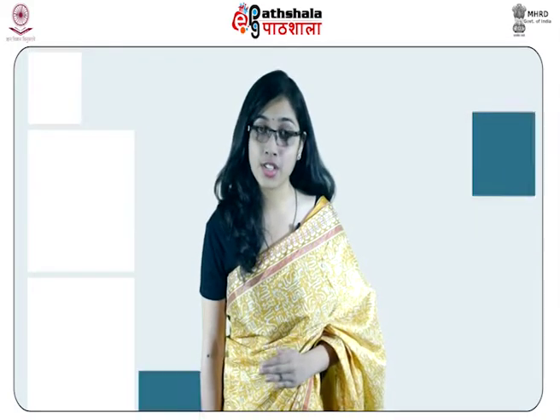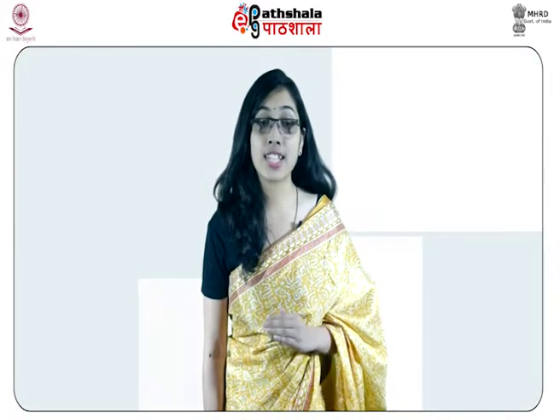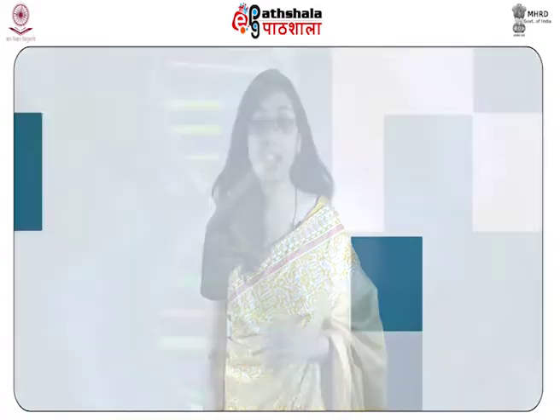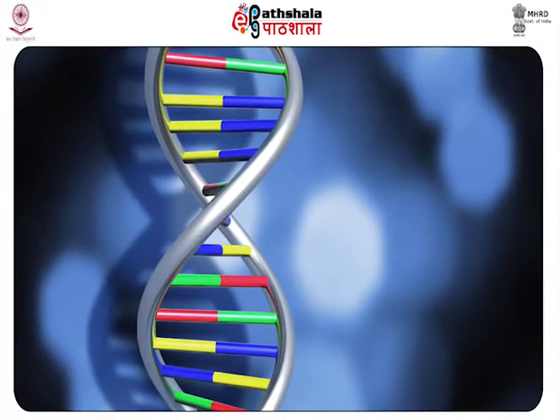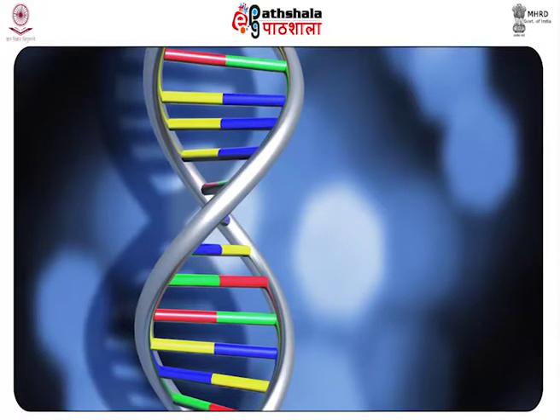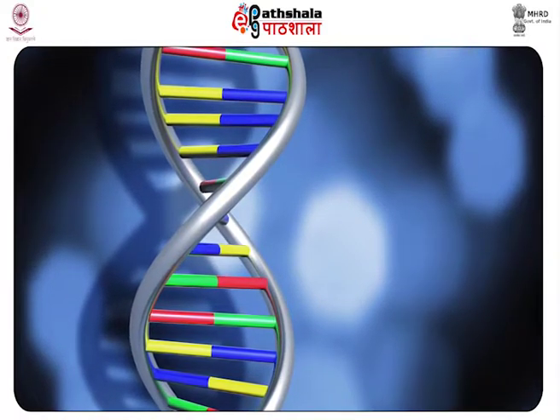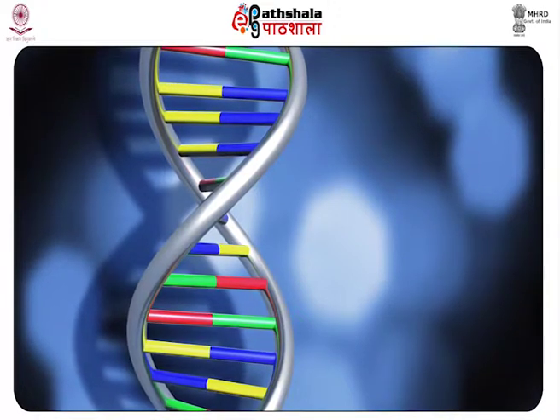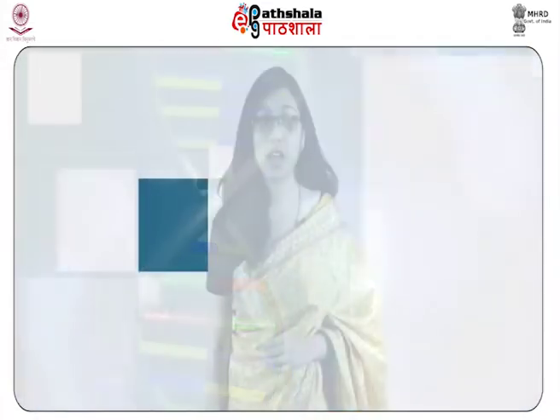Presence of dirt, grease or any other contaminant can seriously compromise the DNA typing process. Such issues will not change DNA alleles from one to another, but it will affect the ability of the scientist to obtain complete DNA profile.